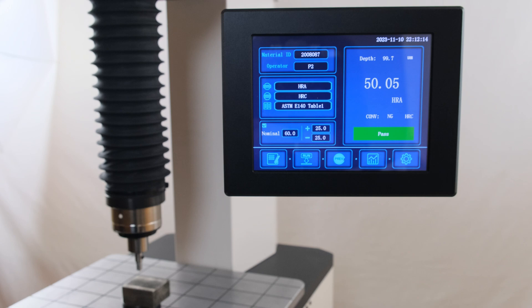These results will include the selected scale, converted value, as well as the raw depth differential. If a go-no-go range was set, then that would be shown as a pass-fail icon below the results.